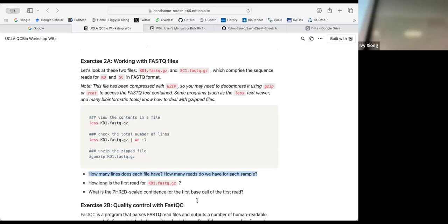So we have V1, V2, etc. So what's going on here? So we have to go. So what's this doing? That brings us to the data. Yeah, so you created a folder for data. Okay. You copy the FastQ files into the data folder. So all the two files are going to be in the data folder.